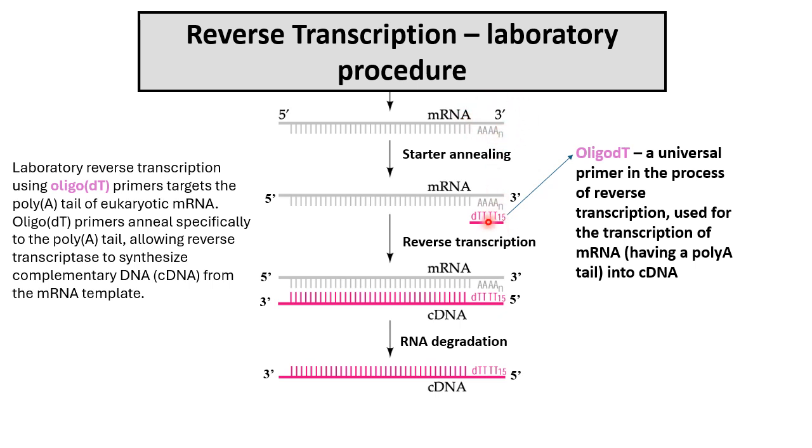And once the primer oligo-dT is attached, the reverse transcriptase, being RNA-dependent DNA polymerase, can start to extend this starter and, in fact, reverse transcribe RNA into the DNA. It's important to keep in mind that every DNA polymerase, and reverse transcriptase is definitely DNA polymerase as it synthesizes DNA, requires a starter to initiate the reaction.